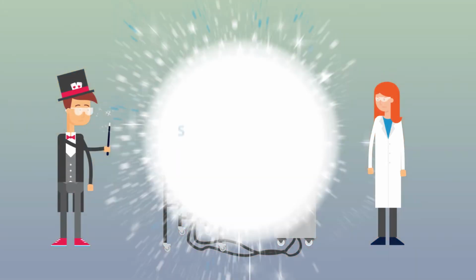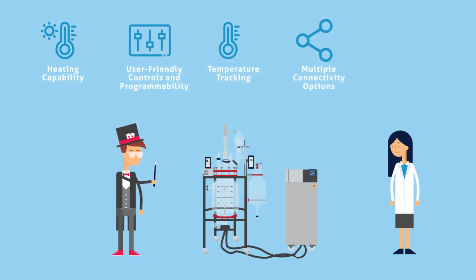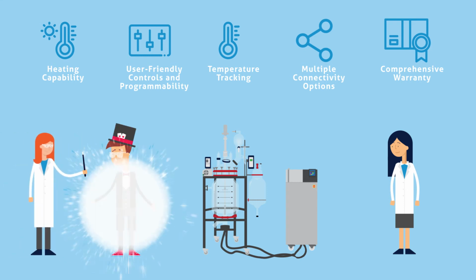Finally, consider all your requirements before making your purchase. Features such as optional heating capability, user-friendly controls and programmability, temperature tracking, multiple connectivity options, and comprehensive warranty are all important factors in determining which system is best for you and your lab.